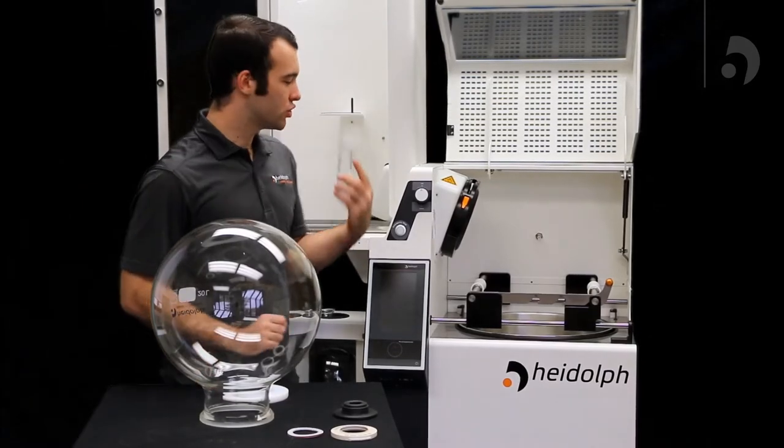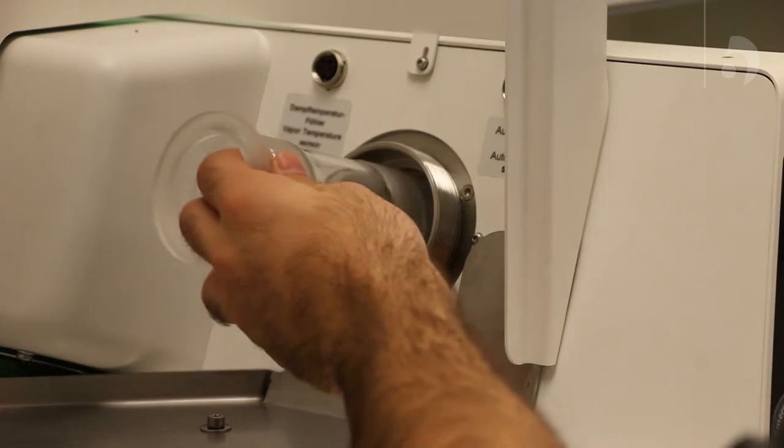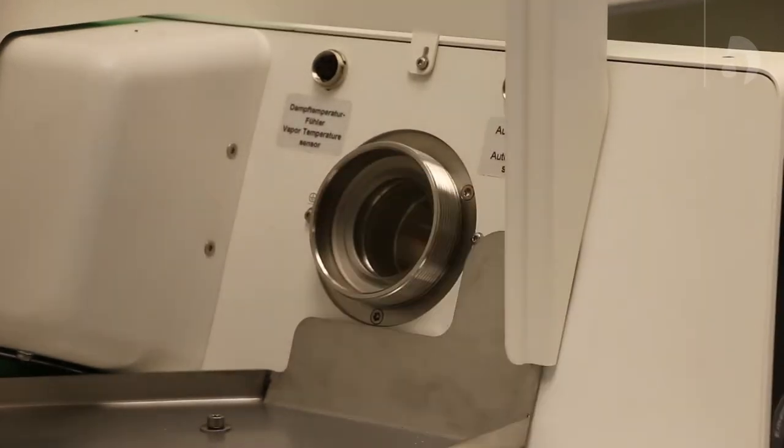Now we're going to add the vapor tube to the unit from the condenser side. It slides right into the unit through the hole and rests at the end.